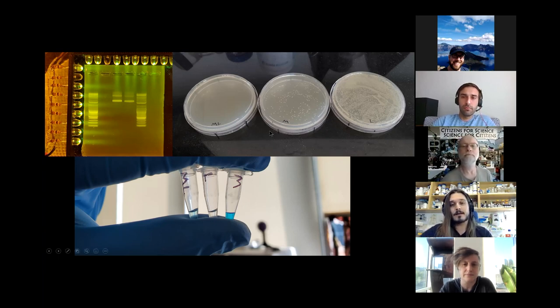And it tracked. Looking at the tubes themselves after 24 hours, M on the right is just methylene blue with no light. So that's our negative control. And all the way on the left is our experimental. You can see the blue actually faded. Right. And one of the hallmarks of methylene blue reducing is that it fades from blue to colorless. So it's doing stuff, but that stuff is also inhibitory. So we're trying to play around with, don't obliterate your DNA, but just change it enough so that we could see something. And we're working with our blue protein to make it fold faster and do all kinds of stuff.